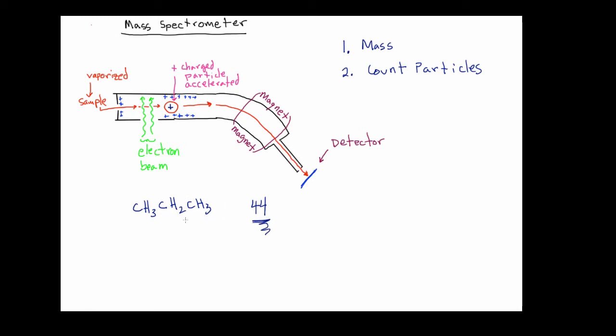Now, here's the thing about looking at more complex molecules that the student has to realize, and that is when we inject these things into the instrument and the molecule encounters this beam of electrons, which, remember, I like to call the electron beam atomic bullets. So as these bullets are streaming across the hallway and our molecule encounters this beam of electrons, we're going to produce positively charged ions.